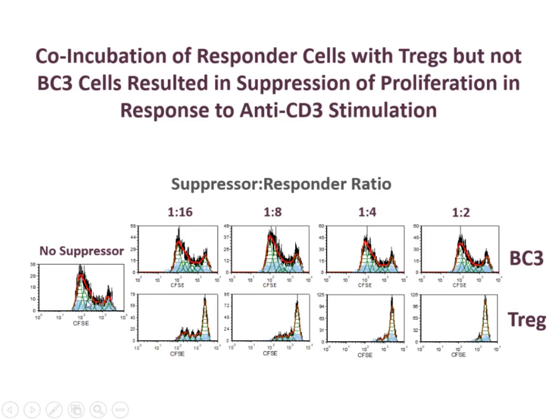And you can perhaps make out these green traces that are the software working out how many generations that's gone on. When you add T regulatory cells, you can see that you have many more cells that are back here at that starting point, still some proliferating, but far less than the control. And with increasing numbers of T regulatory cells, you can push that proliferation just about to nothing.